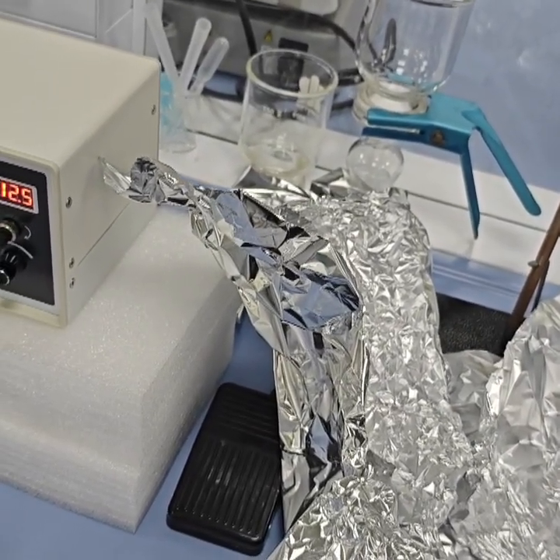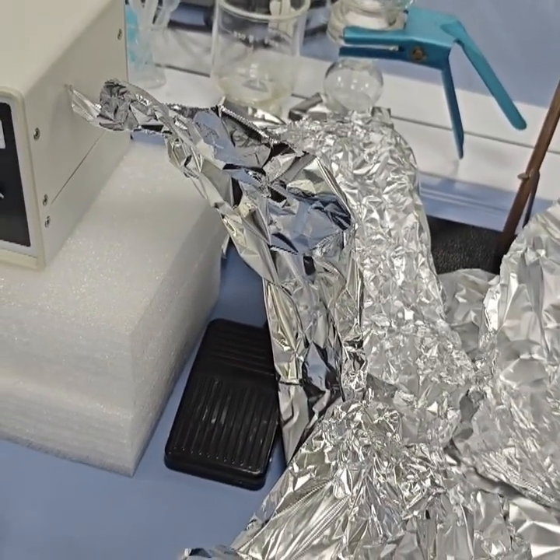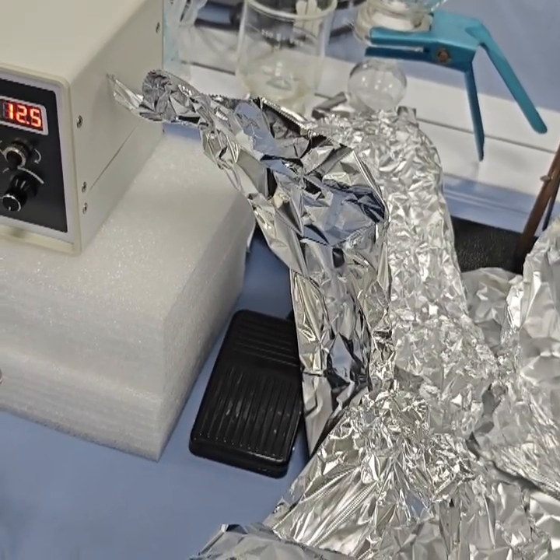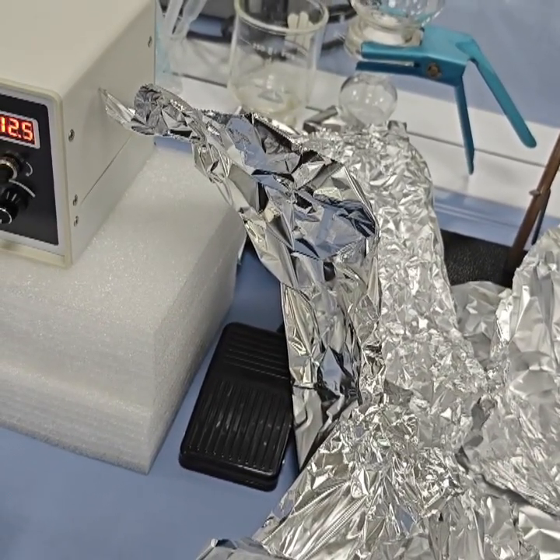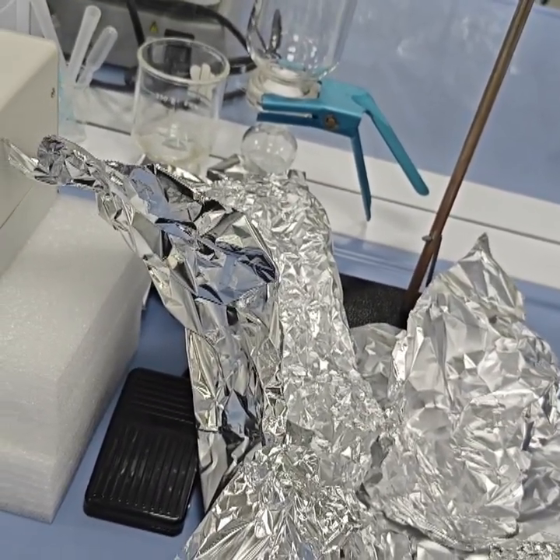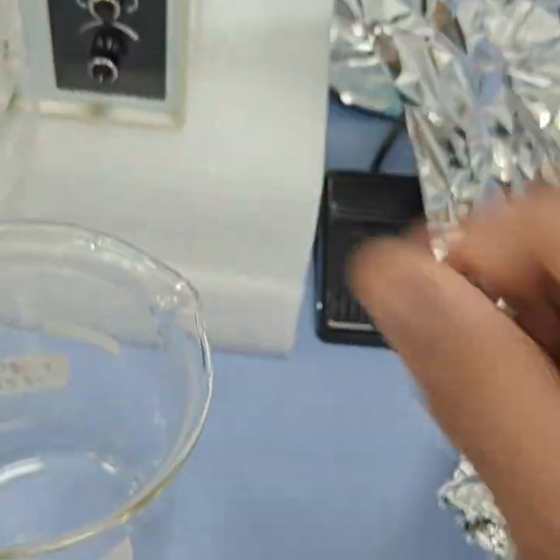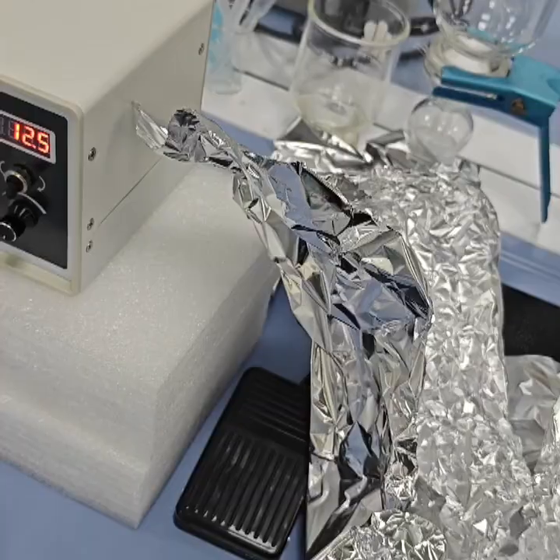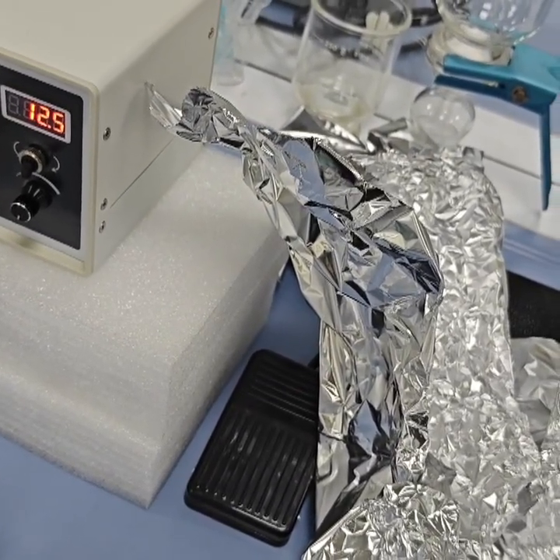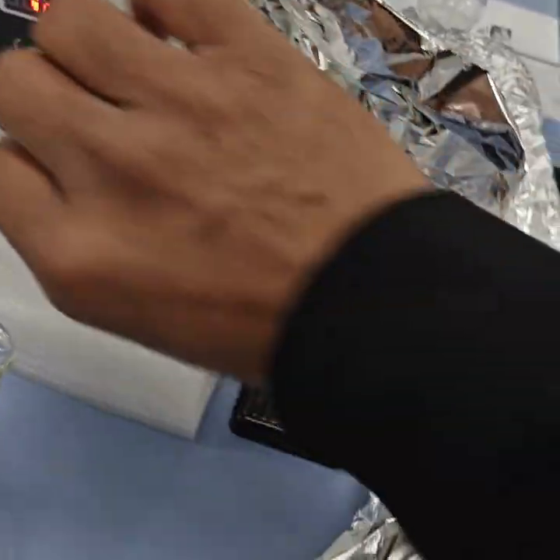The main component here is my peristaltic pump. This pump controls the flow rate precisely, pumps the pollutant solution without contamination, and ensures steady, pulsation-free flow. The key point is that in a peristaltic pump, the liquid never contacts the pump mechanism, only the tubing, which came from the manufacturer, making it ideal for chemical and wastewater experiments. The typical flow can be 1.5 to 5 ml per minute depending on the tubing and speed, and you can adjust it using this switch.